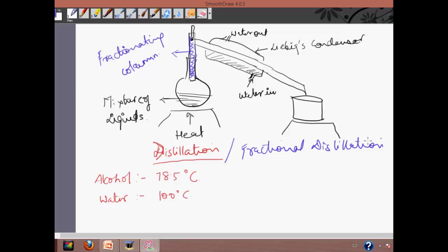What happens in this process is it involves distillation and collection of fractions, or different liquids boiling at different temperatures. In simple distillation we have to carry on the heating as long as we get separate distilled liquids. Now by using the fractional column we can separate all the liquids at a time. Complete separation is possible if the boiling points of the liquids differ by 30 degrees centigrade or more. That is a rule, or a mandate.